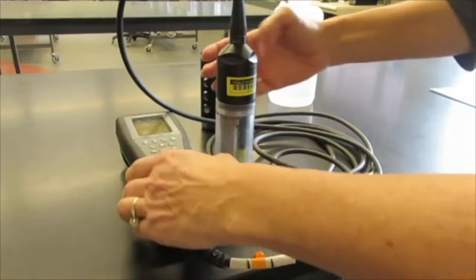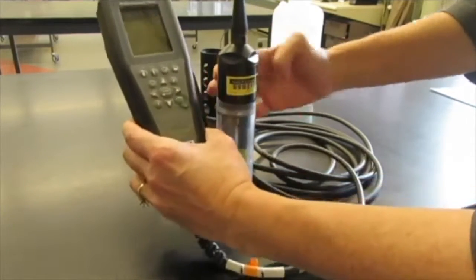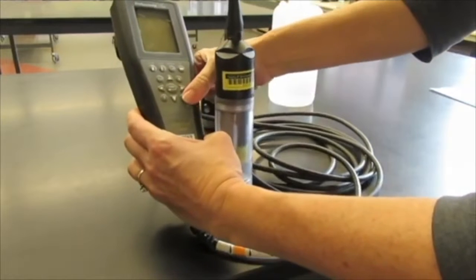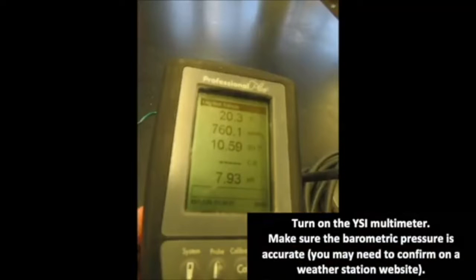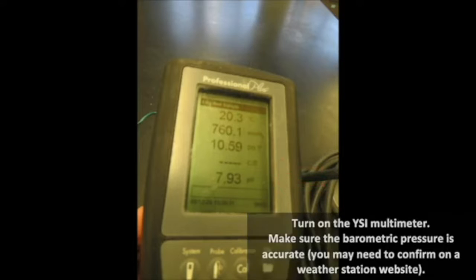Next step is to turn on the YSI multimeter using the power button. You will see numerous readings here: the first line is our temperature, our barometric pressure, our dissolved oxygen in milligrams per liter, a probe that is not connected, and our pH probe. Now we are going to wait 10 minutes for the dissolved oxygen probe to stabilize.